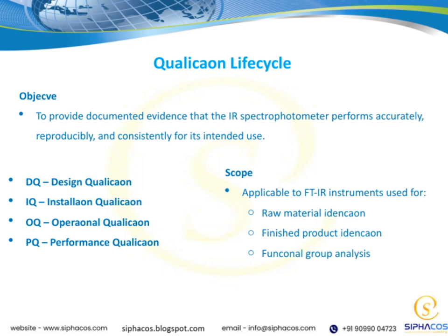Moving on to the objective, our main goal here is to establish documented evidence that these IR spectrophotometers are performing accurately, reproducibly, and consistently for their intended purposes. This means we want to ensure the instrument's performance is reliable over time and across different conditions.